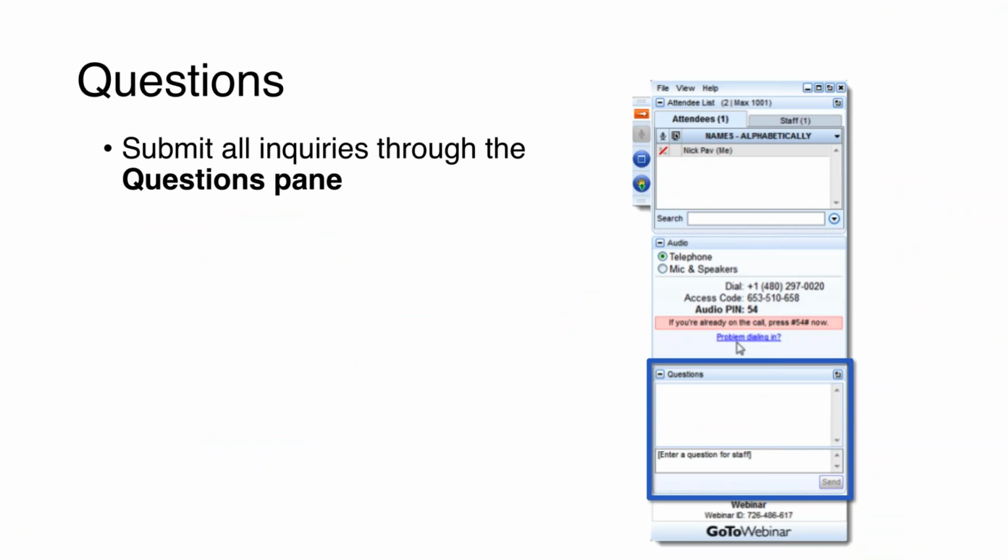And building on that comment, and this isn't just true for cryo-EM but for other instruments we've seen, a lot of times people are building a new facility for new instrumentation. I would strongly encourage that if you're building a new facility, go for high performance connectivity, because even if you don't absolutely need it today, you will enjoy that performance and probably need it down the line. Obviously, it's a different question if you're retrofitting an old building and it's harder to get a data line in or something like that.